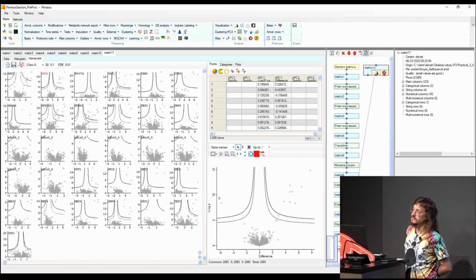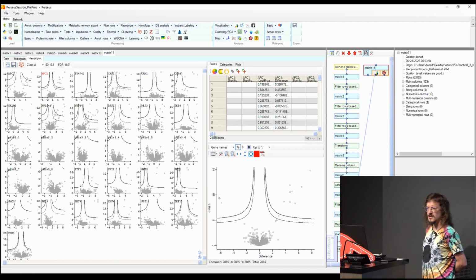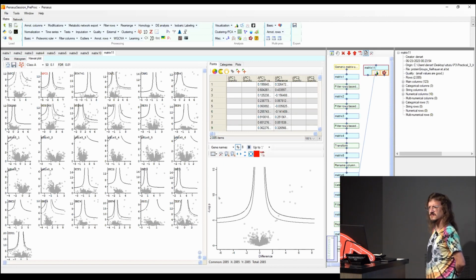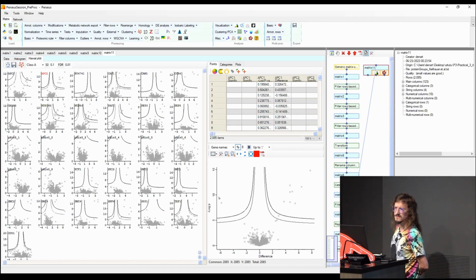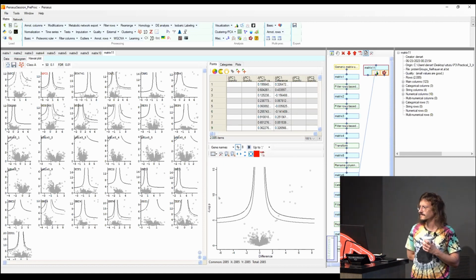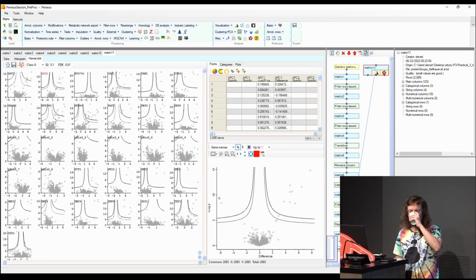Well, yeah, I would say so. I mean, it shouldn't give you an error, right? Honestly, I haven't tried with the empty values, but it shouldn't give you an error, and it would work in principle. But I think you get better results if you do impute here, right? Because then you get better step profiles for the t-test, basically, if you use imputed values instead of just losing these values. Okay.